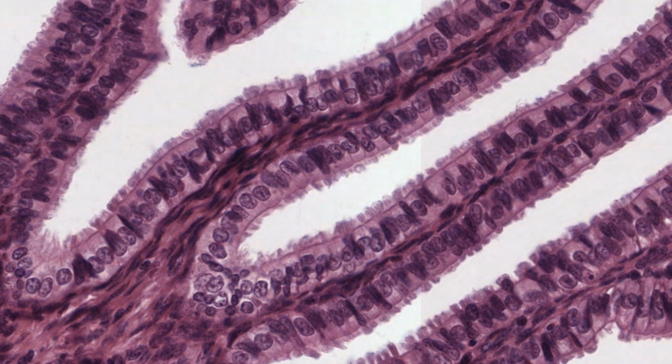It's certainly ciliated, but simple columnar? Looking at this image here, I'd have to say that the majority of epithelial cells are cuboidal, as they've got nice rounded nuclei. But perhaps up here, they have a leaning towards being columnar, as some of their nuclei appear to be elongated.